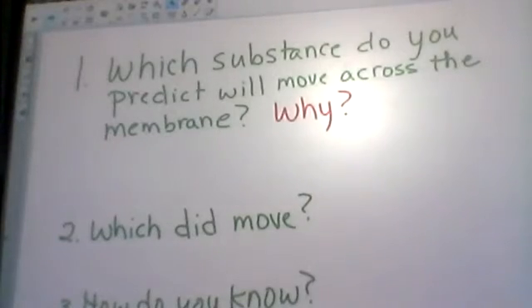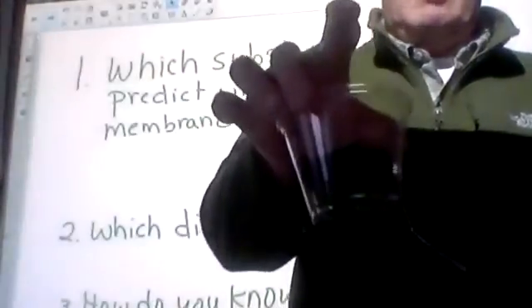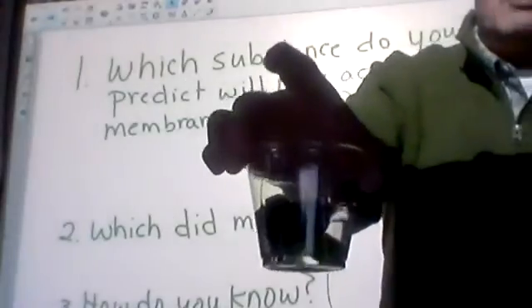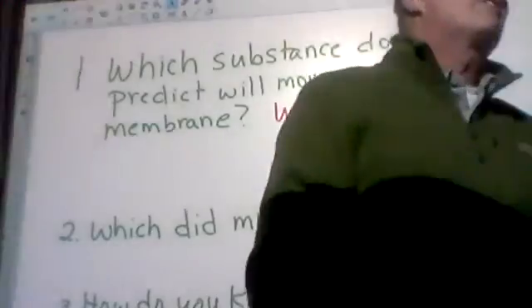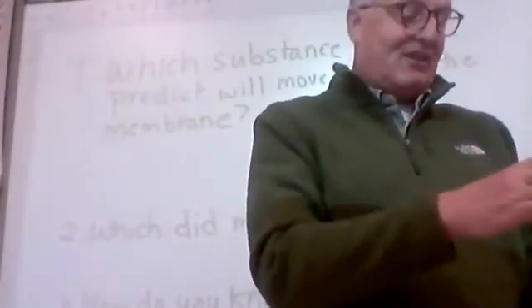All right, next, let's see if we can. Wow, whoa, it's gotta be this way. That's what you see, and actually, sorry, can you turn the lights on? Look at that quick first step. Oh, he's got no competition now. Sorry, Olivia, he got the lights.